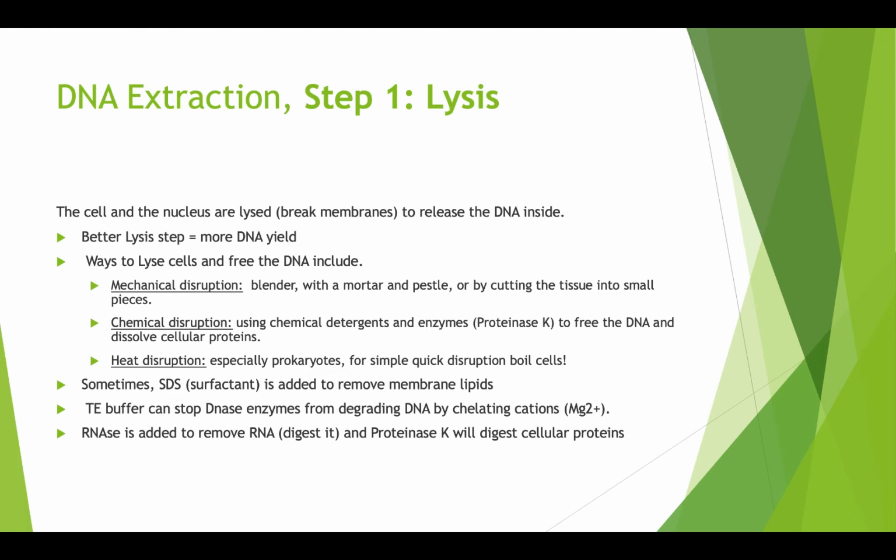فإذا حكينا إن الخلية عبارة عن a bag, lipid membrane, right? And it has all this cytoplasm inside, and then the cytoplasm contains all these proteins, enzymes, and then the DNA. So you need to have a mechanism to disrupt these membranes, the cytoplasmic membrane or the cell membrane and the nuclear membrane. So you need to break this and then release the DNA. So the more cells you break apart, the more nuclei that you break, the more DNA that is released, and obviously that will increase your DNA yield.